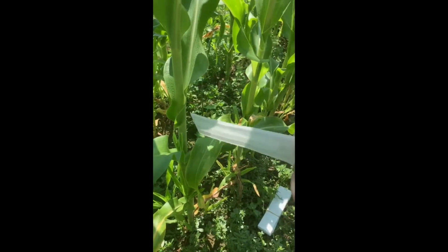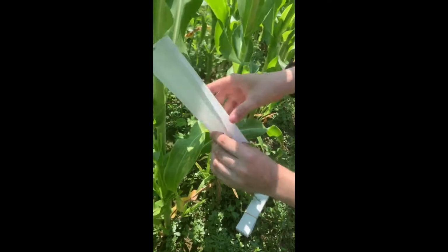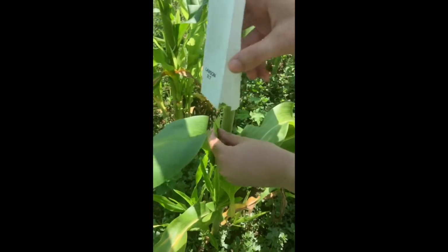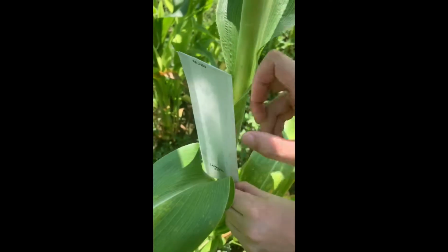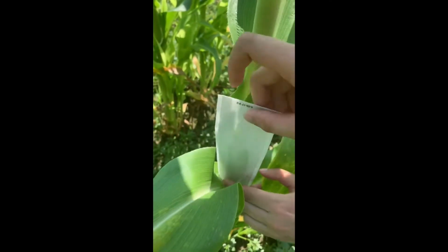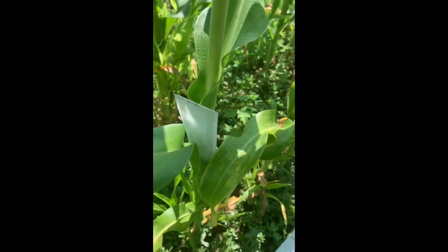You take the side that's longer, the side that does not have text on it, and you put that against the stalk. And you want to put it over the ear, making sure that you're not missing any of the leaves. So you put it down, nice and tight. You check the front and the back to make sure that you haven't missed any leaves. And then move on to the next one.